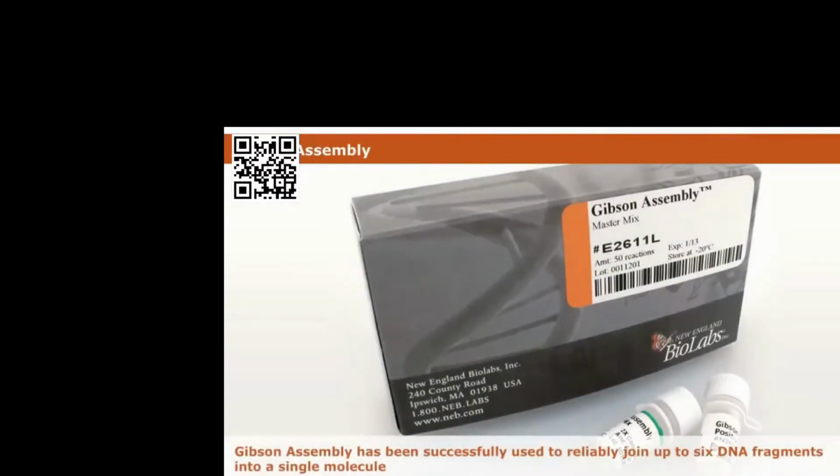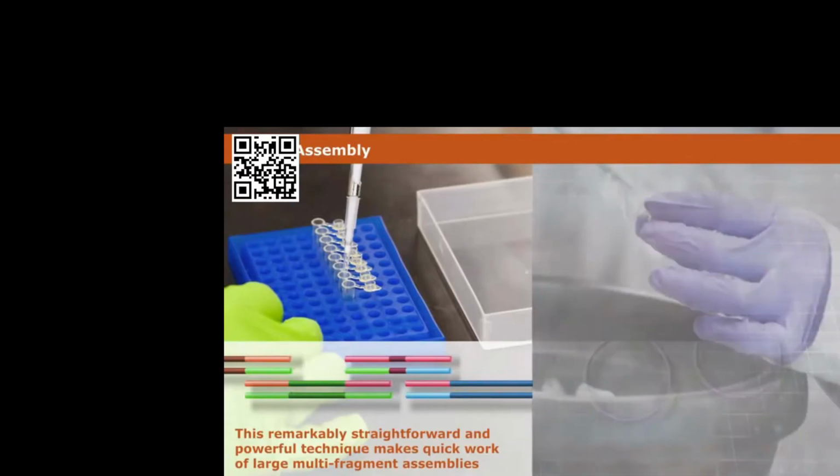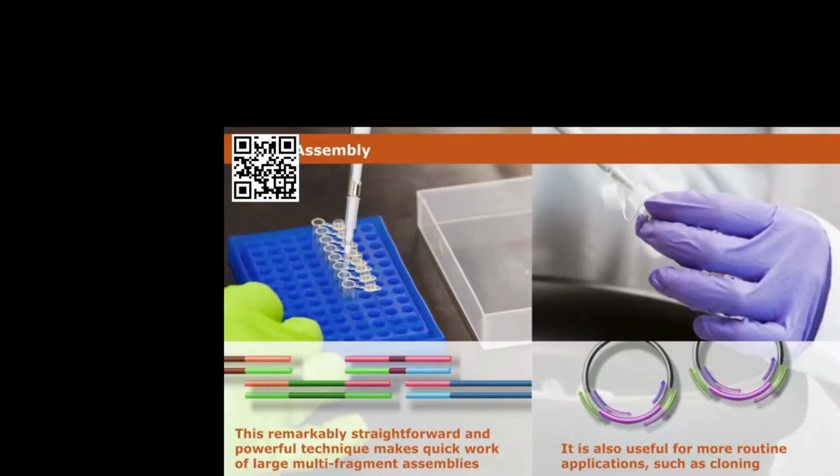Gibson assembly has been successfully used to reliably join up to 6 DNA fragments into a single molecule. This remarkably straightforward and powerful technique makes quick work of large multi-fragment assemblies, but it is also useful for more routine applications, such as cloning.